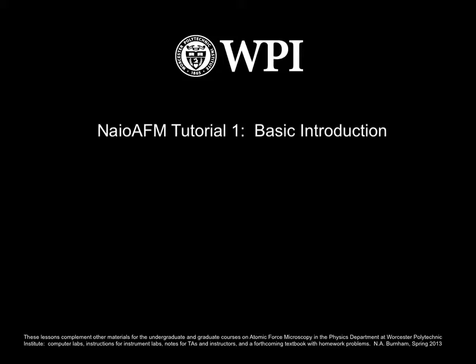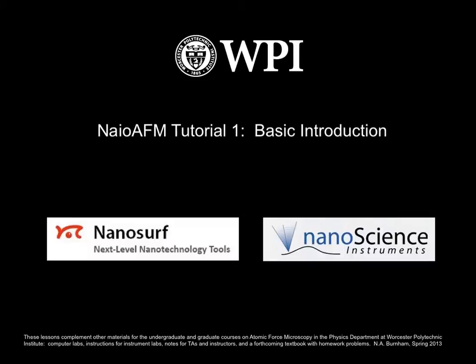Hello everyone. This video is to help you learn how to use the NIO AFM, or Nano All-in-One Atomic Force Microscope. The NIO AFM is made by NanoSurf and is also sold under the name of TRAX by Nanoscience Instruments.